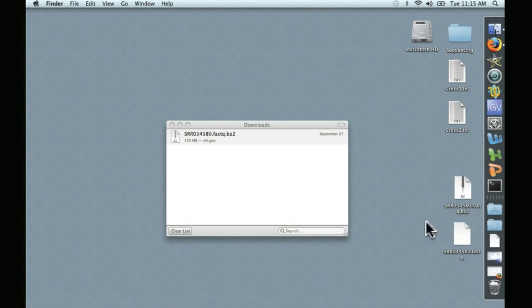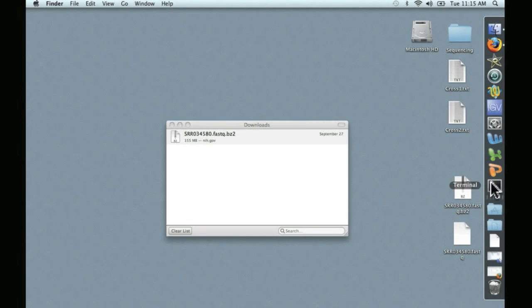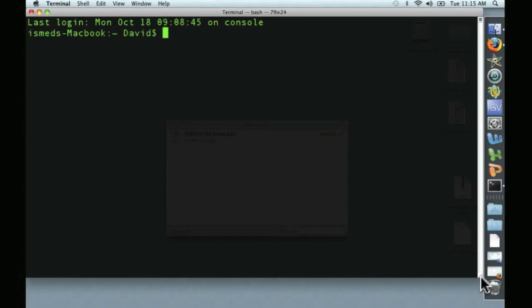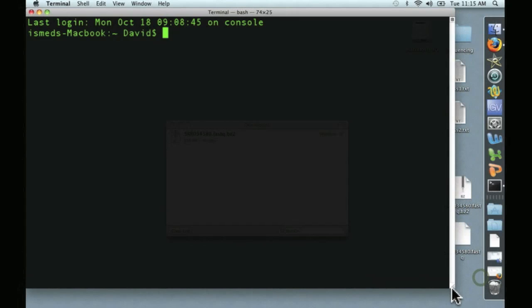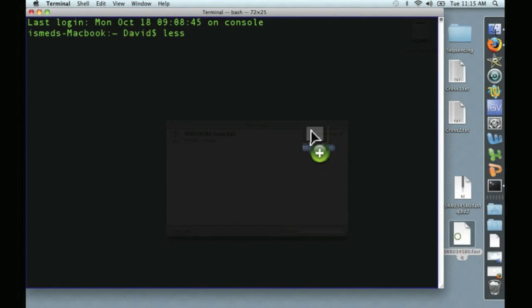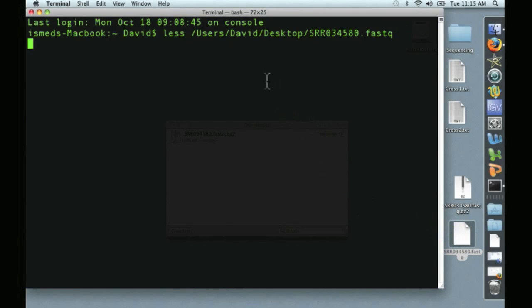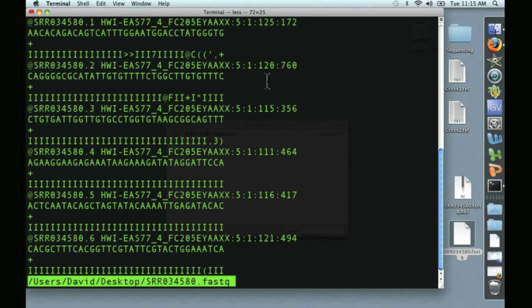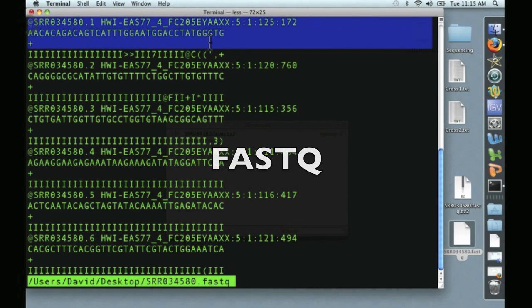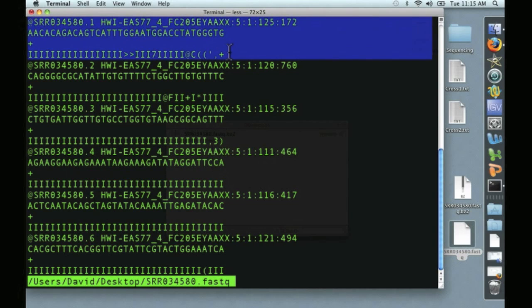And here it is. It's in FASTQ format. Let's go ahead and take a quick look at it using our old friend, the terminal. Resize this just a bit. We're going to use less, drag and drop the file name. We'll take a look at the file. This is FASTQ format, so each read has four lines, which I've highlighted here.